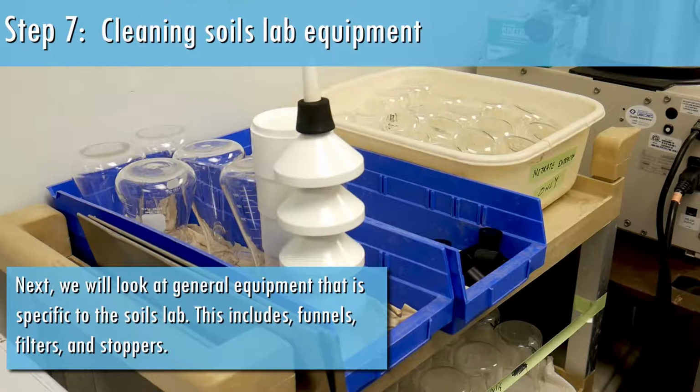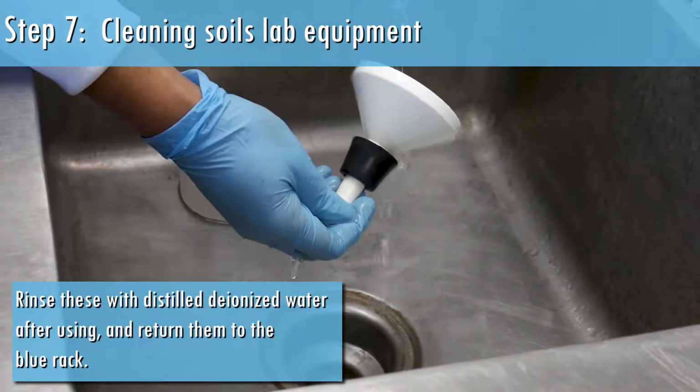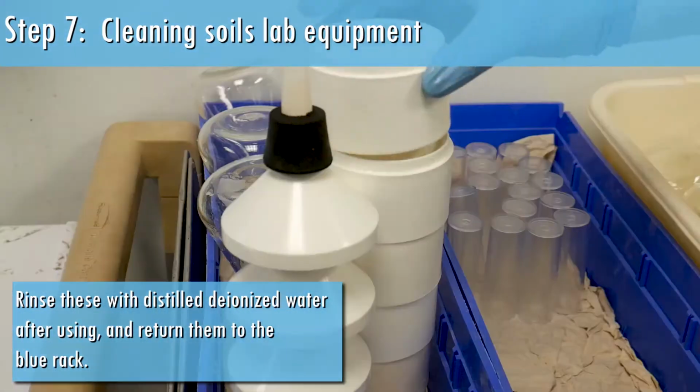Next, we will look at the general equipment that is specific to the soils lab. This includes funnels, filters, and stoppers. Rinse these with distilled deionized water after using and return them to the blue rack.